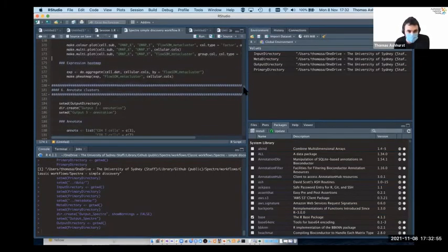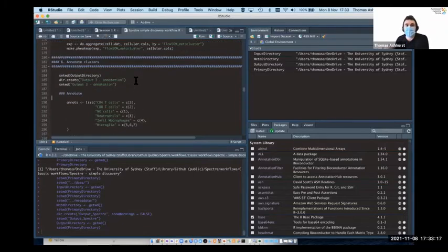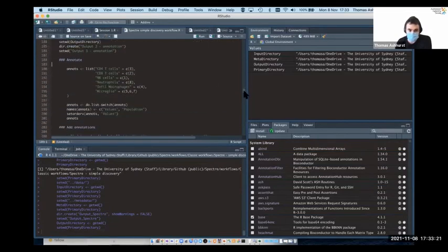After clustering, we almost always annotate. So we get the data in, make some preparations for it, do the clustering, and then we want to label the cells that have been clustered so that we understand a little bit about what's happening to them. Having a group of cells called cluster 1 is helpful, but it would be arguably more helpful if we could say, okay, those are our CD4 T cells or our CD8 T cells. It gives some kind of meaningful, interpretable answer.